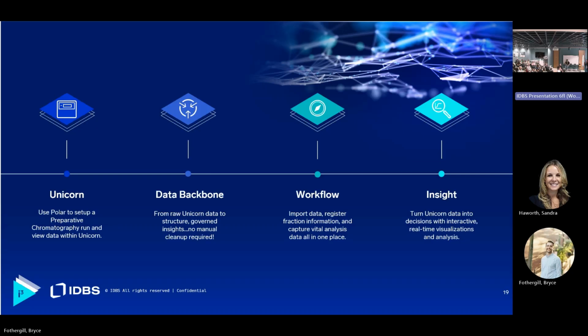I suppose some of the limitations that we're aware of, that we wanted to address with this new framework, it will still suffer from, but it is still absolutely a perfectly usable and serviceable tool. And there are a lot of customers out there doing exactly, I think, what you've probably got in mind right now.